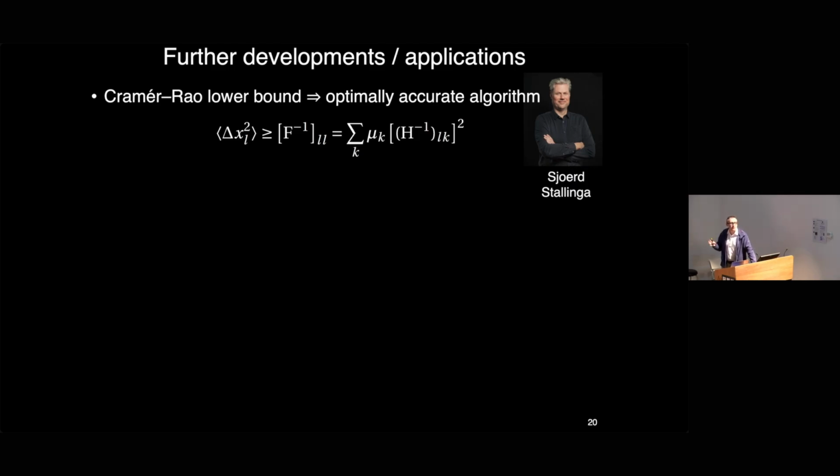So we don't need to worry about making it more accurate. It would be nice if we sped it up. So we sped it up 4,000 times. And so now, rather than taking a second to process a single image, it takes less than a millisecond. So in theory, you could unmix in real time, never actually see the raw data, and just be seeing your separated components as you require it.